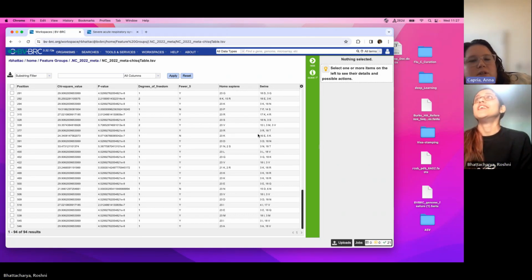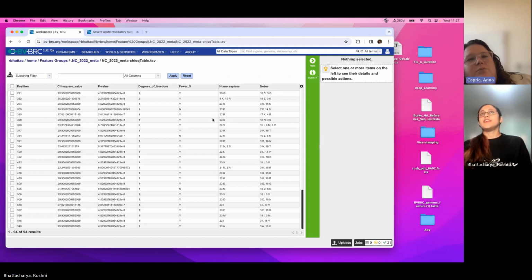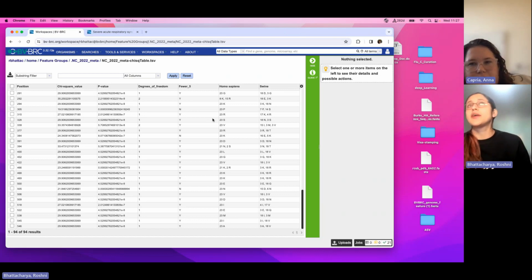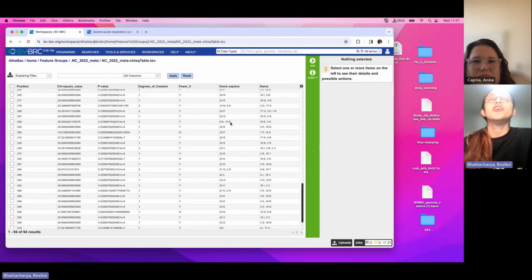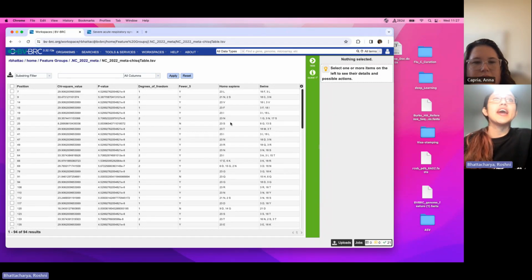So you're using this as a guide for the next step, and not every output of the Meta-CATS is going to be the reason the groups are separated. This is a supporting segment. If you need statistical evidence for your results, this can be one of it. But you need other analysis results to support this. This can be a support, but this is not an explanatory thing. So here comes the end of the Meta-CATS.